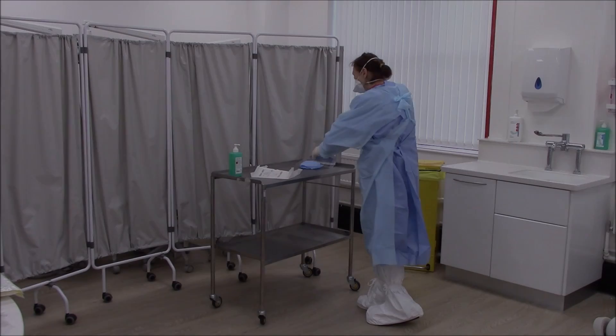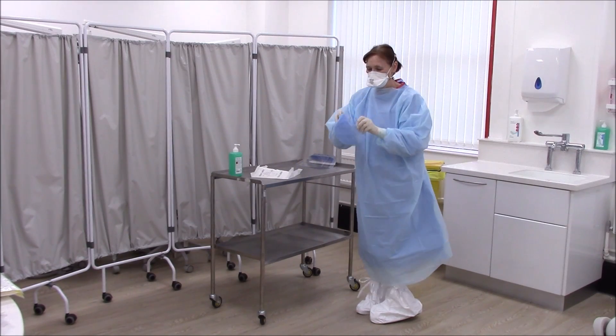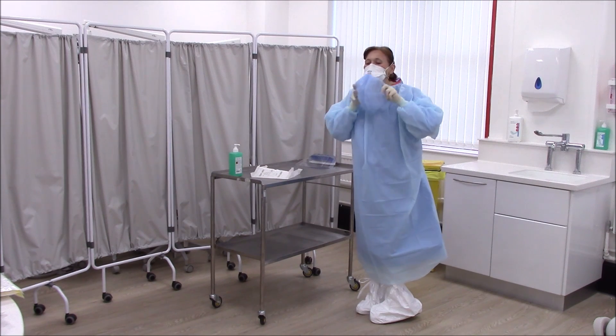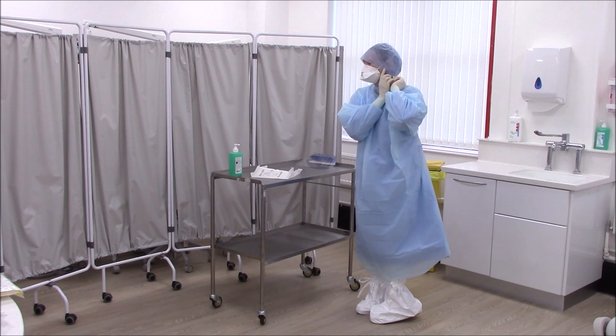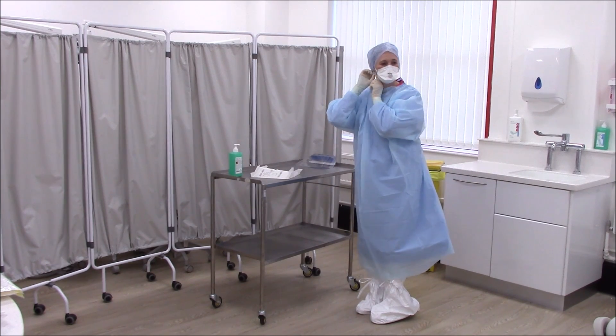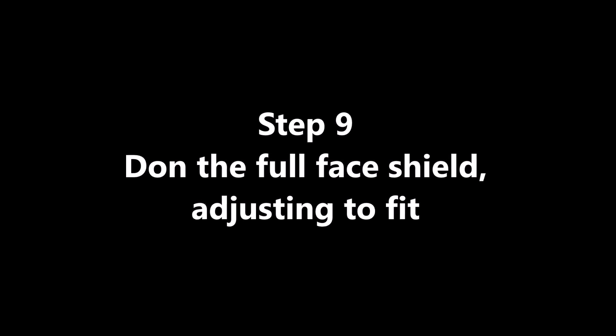Don the surgical cap. Don the full face shield, adjusting to fit.